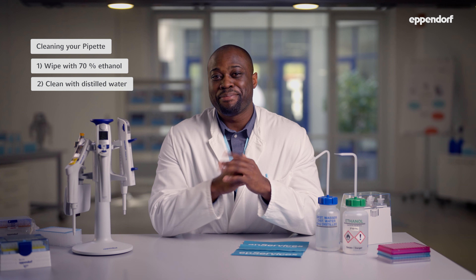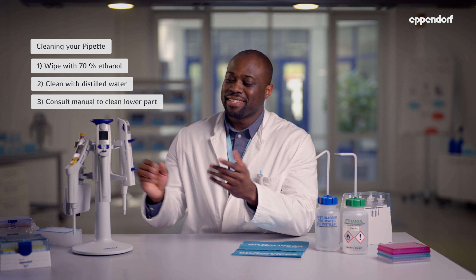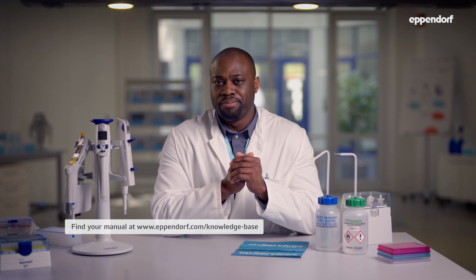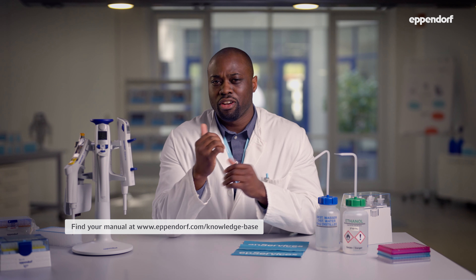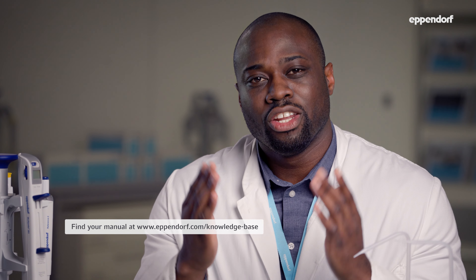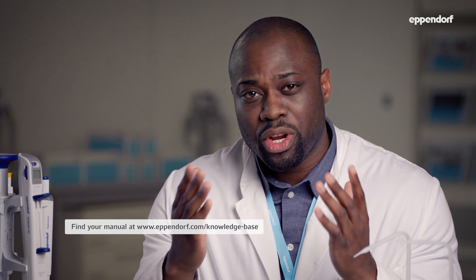It's possible for the inside parts of your pipet to be contaminated. This can happen, for example, if you accidentally over-pipet or aerosols get in past the tip. In cases like these, you need to take apart the lower part of your pipet for cleaning. Taking apart and cleaning an Eppendorf pipet is pretty easy, but the steps may be different depending on the model. To learn how to take apart your particular pipet, take a look at the operating manual at Eppendorf.com.